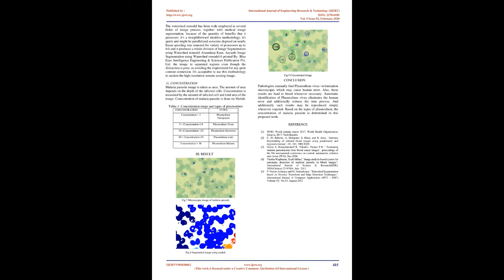Opening is filtering the binary image at a scale defined by the dimensions of the structuring element. Only those parts of the image that fit the structuring element are passed by the filter; smaller structures are blocked and excluded from the output image. The dimensions of the structuring element are most significant to eliminate cluttering details, but not to harm objects of interest.